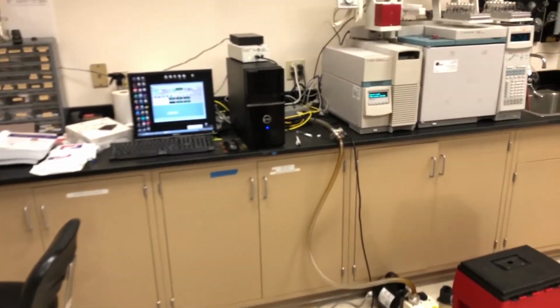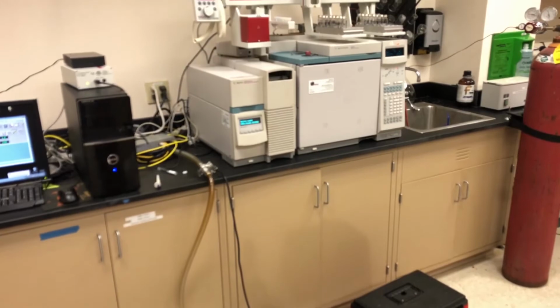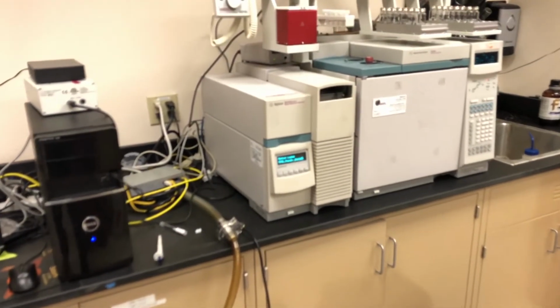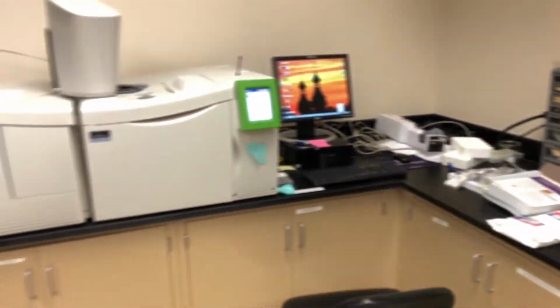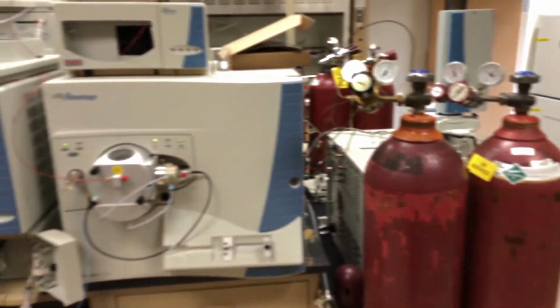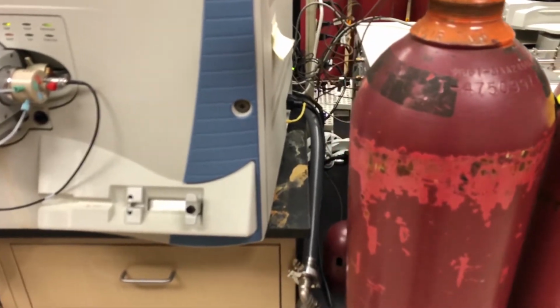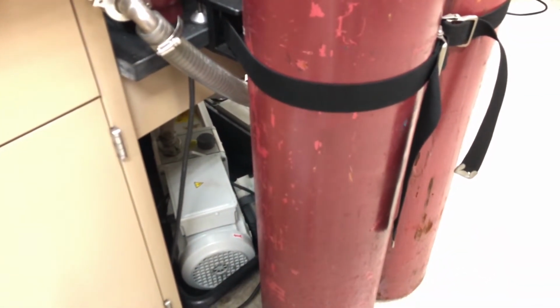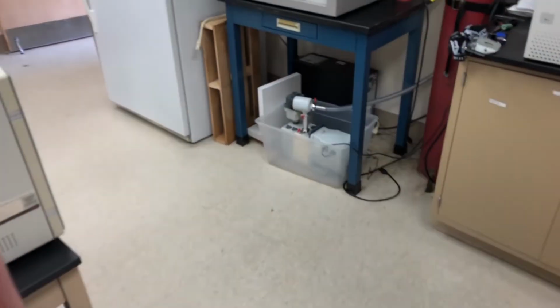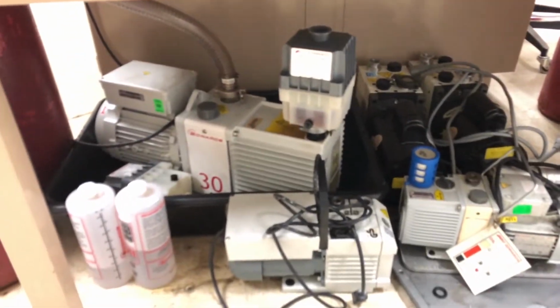If we go over to this GCMS, which we'll use a lot in toxicology, again, we have a big noisy mechanical vacuum pump on the floor, vacuum hose going into the mass spectrometer, which also has a second vacuum pump inside of it. If we whip around here and take a look at the LCMS, this guy has an atmospheric pressure interface. So we have a big old pump that goes on this guy. Our other mass spectrometer actually has 2 of these big giant pumps. So big noisy pumps everywhere outside, and each of these mass spectrometers has a second pump inside. Let's take a brief look at how those pumps work.